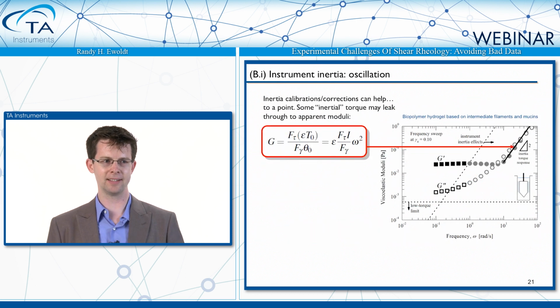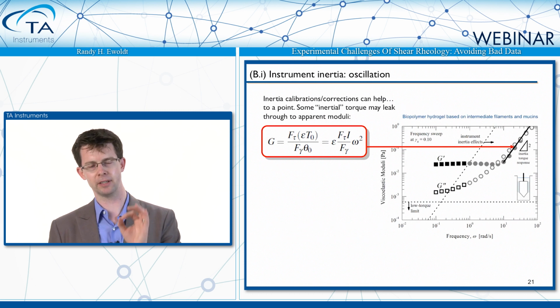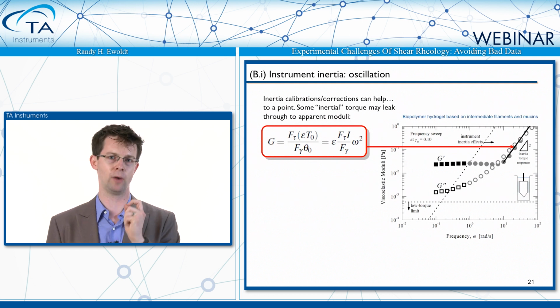So what I want to show here is that if you do make this correction, however good your correction is, it's only good to a certain percent. Nothing is perfect, and if you make measurements, that's a creed you should always remember. Nothing is perfect. There's always some uncertainty. There's an uncertainty even in the correction.